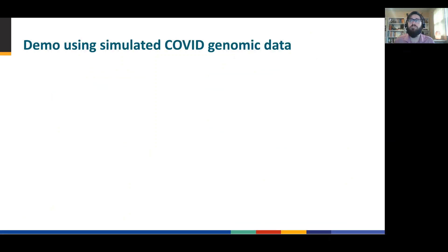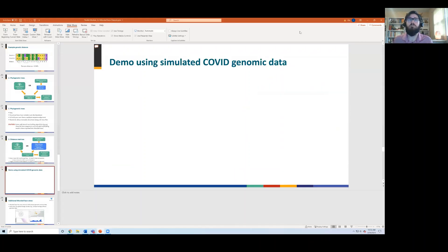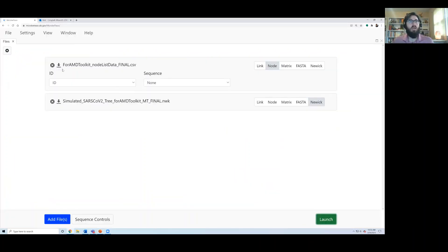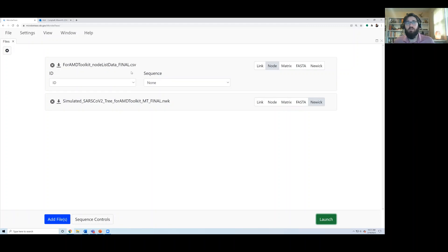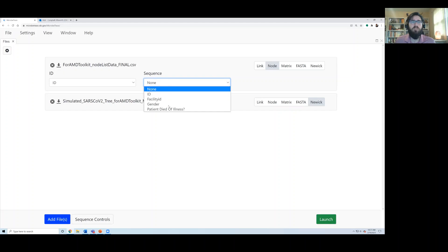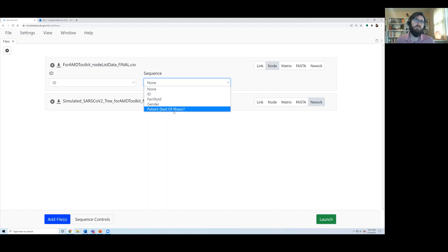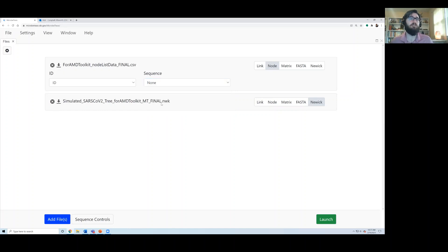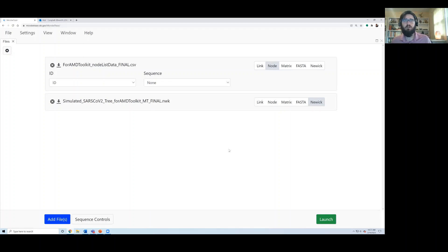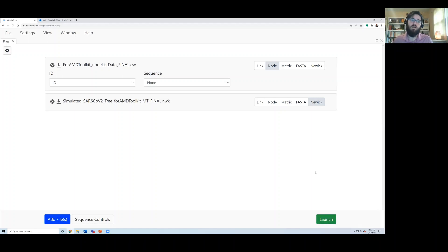I'm going to switch over to a demonstration of MicrobeTrace using actual files. And as you see at the top, we have a node list that just describes the characteristics of individuals. For example, we've got things like the facility ID if they're in a skilled nursing facility, gender, and whether the patient's vital status. And then we also have a Newick tree. Again, these are simulated data, but this will give you an idea of what we're working with. So once we drag those two files on, we can hit launch, and our network will come into view.